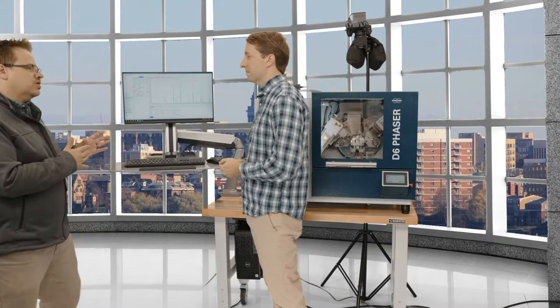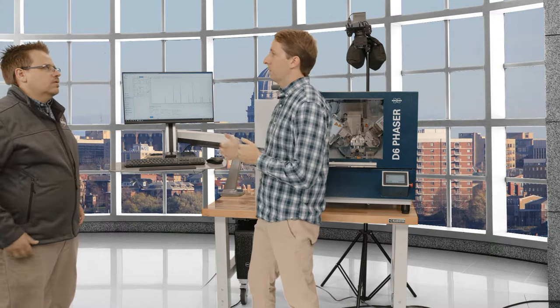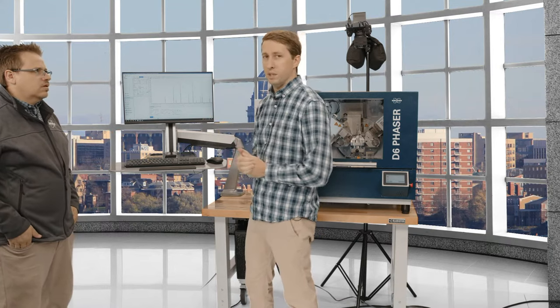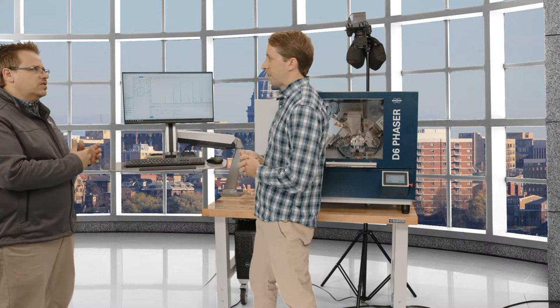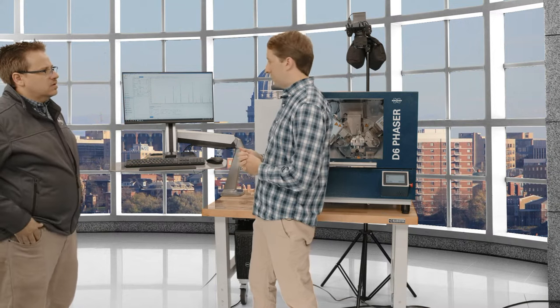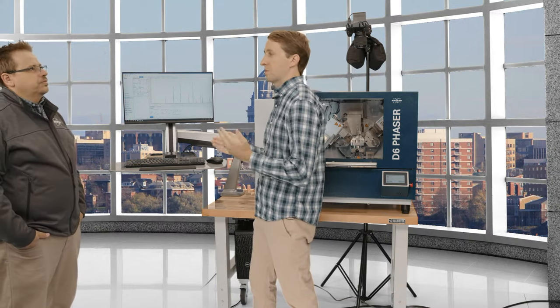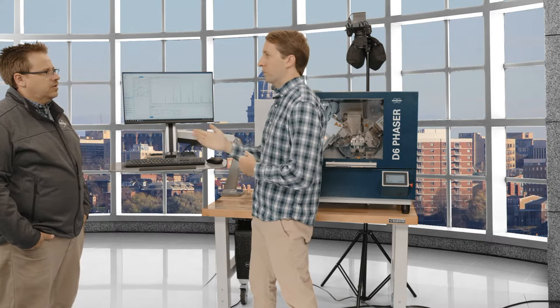So physically in the sample, the low angle peaks correspond to what? Those correspond to maybe lower Miller indices, or maybe the actual size of the unit cell. Okay, so that's because these are kind of superstructures, so you get those peaks down there. Mm-hmm. And the high angle stuff, that's giving you the little intricacies of the... Exactly, especially if you're trying to do things like structure solutions, and you need the intensity and all those little peaks to determine where your electrons are.